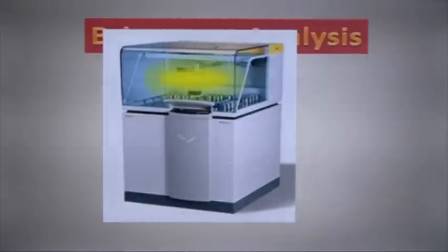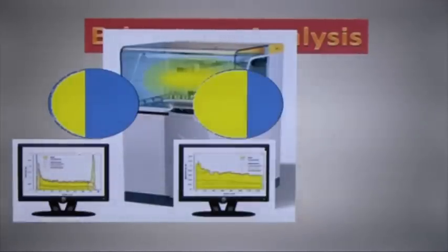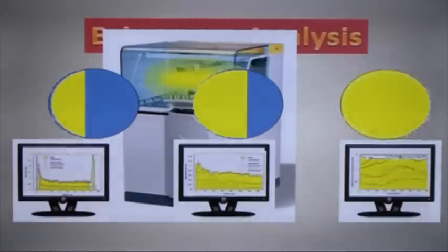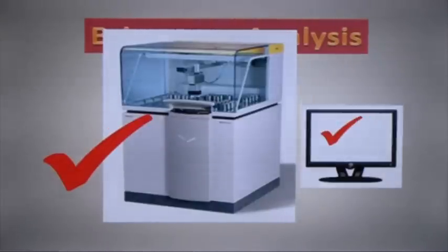So our samples are ready. The analysis process begins. The machine looks at the 30% sample, gives us a readout and says, yes, I can see approximately 30%. In fact, fairly accurately 30%. It looks at the 60% sample. It says, yep, I can see 60%. It looks at the pure, or as pure as we can get, sample, and it says, yes, I can see a pure sample. So far, we know that the machine is working correctly. It's seeing the proportions because we know what the proportions are, and we are getting the correct readout.